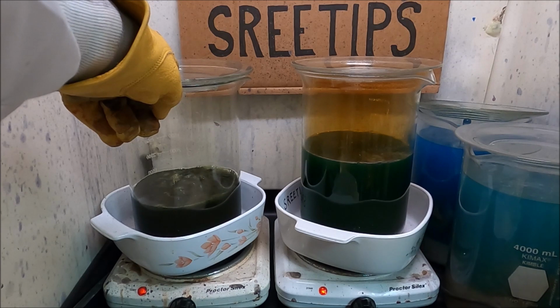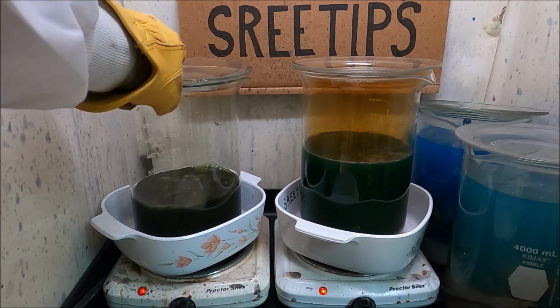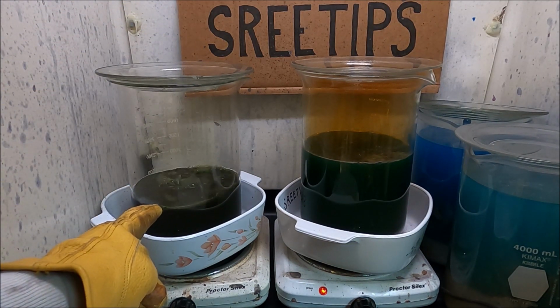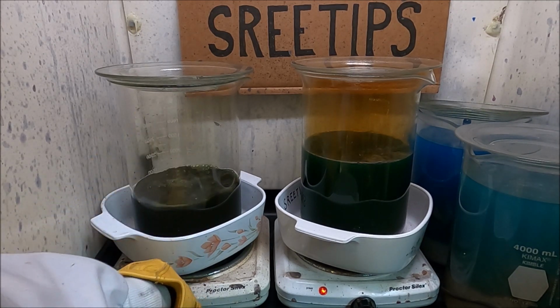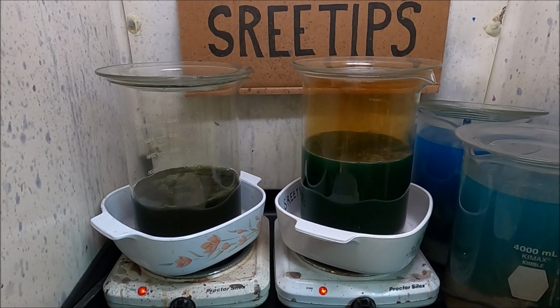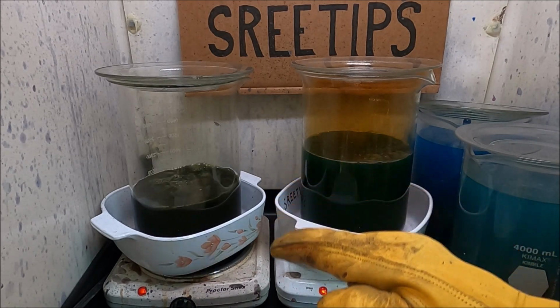Beaker over here on the left with the finely divided solids, filter paper in it. It's got a nice rolling boil. I'm going to turn the heat off now. Notice that there's no fumes being produced, or very light fumes being produced in there, so that means that reaction's done. Kill the heat on that now and let it settle out.